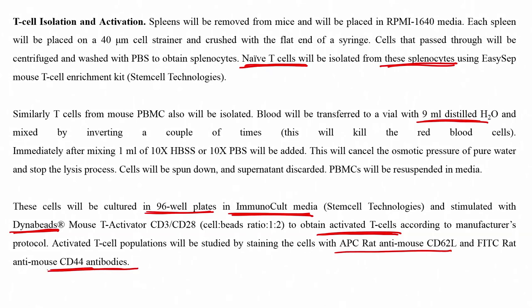So, do not get confused. This is a procedure to activate T cells, known by cancer oncologists. It is an extremely easy process if you follow the protocol. We are learning this to understand what kind of device we are using and how it will be used in immunotherapy.